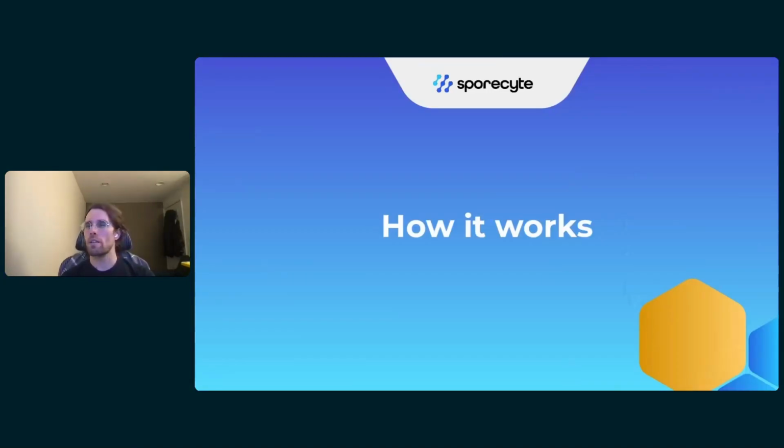How it works, what it does, we'll kind of get into some of the things this app does and how you would use it out in the field.